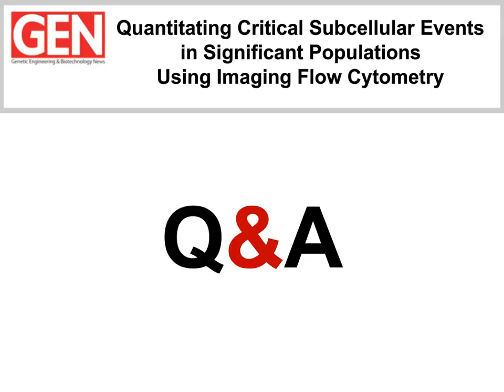Well, it's a very good question. Actually, no, the pH3 is not necessary. We used to use this staining to make our life a little bit easier whenever we were trying to detect the mitotic cells, but it turns out that the pH3 is not very well expressed by anaphasic cells. So it's really good to detect the prophasic and metaphasic cells, but not the anaphasic cells.